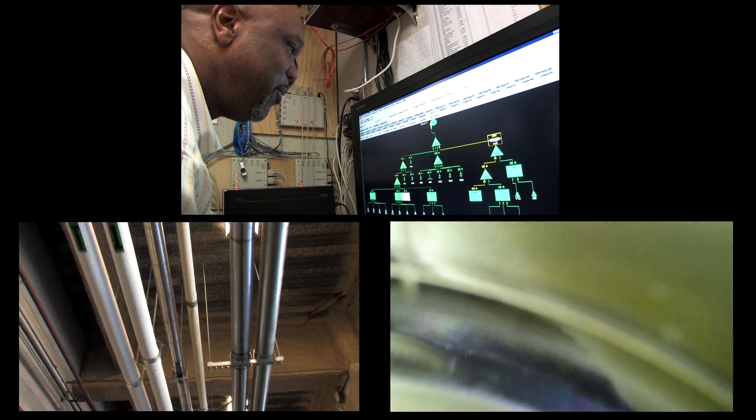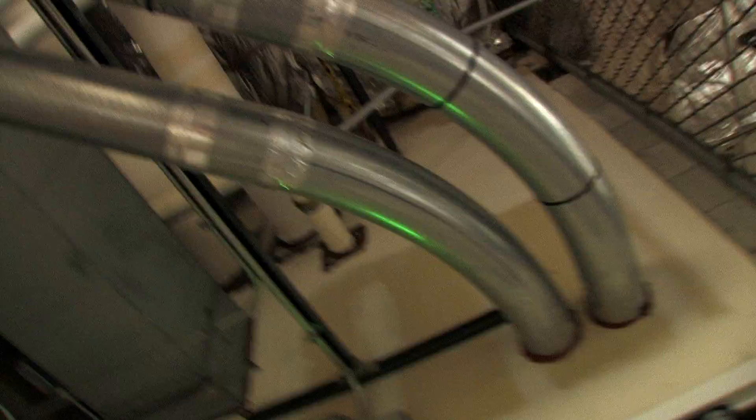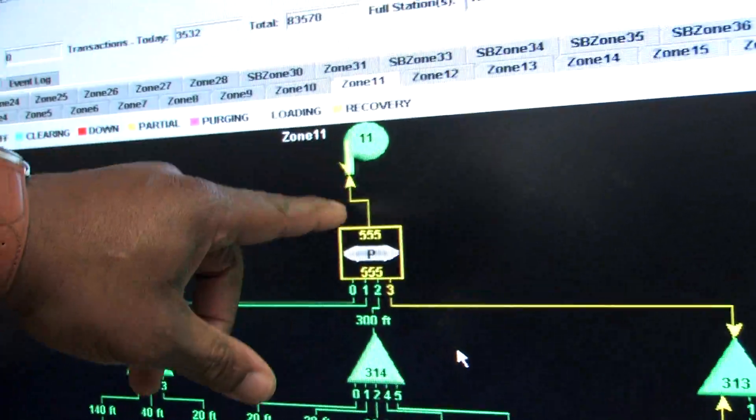We're watching the travel of the carrier. It's going up, it's going to the penthouse right now through this path here. When it passes this transfer unit, now it's at the top level. Now here it comes, coming back, taking this path back to this station which is 555.